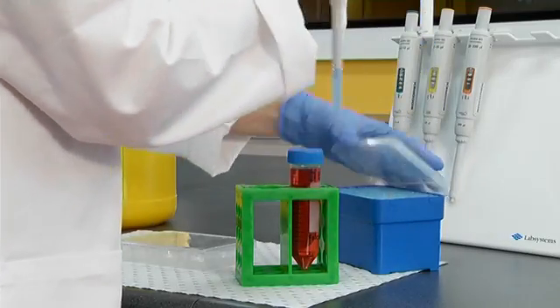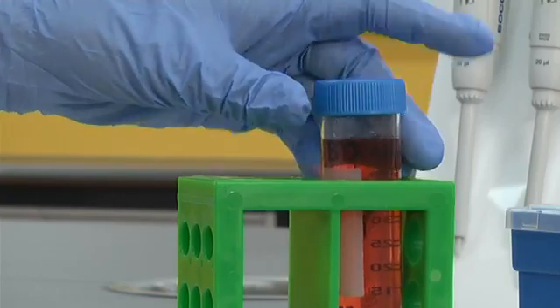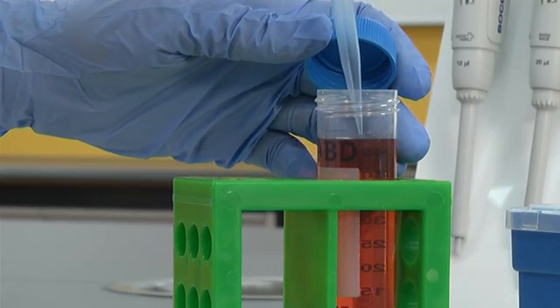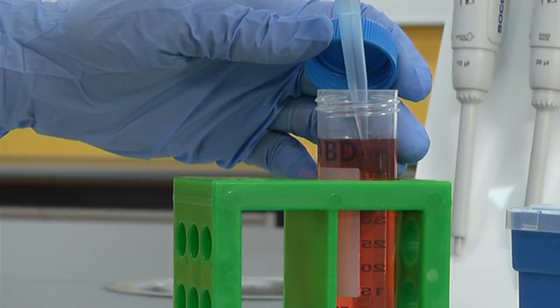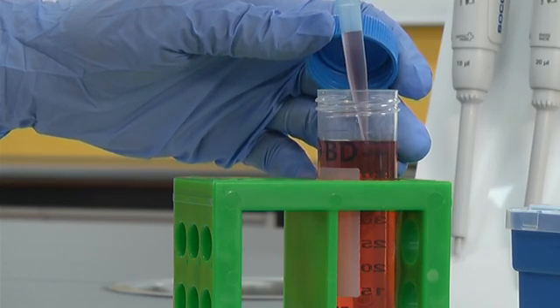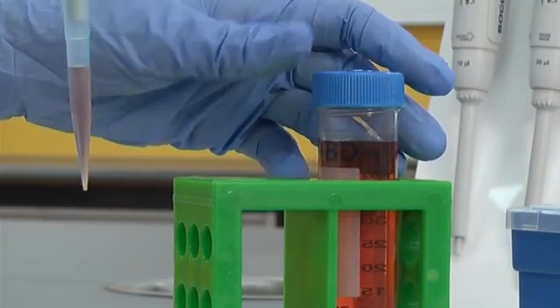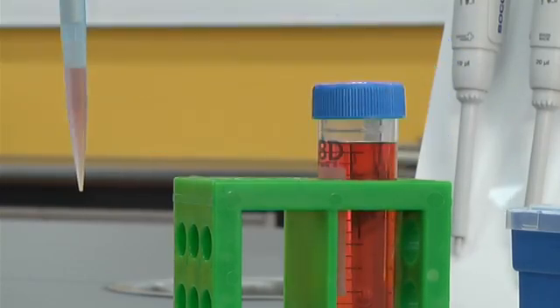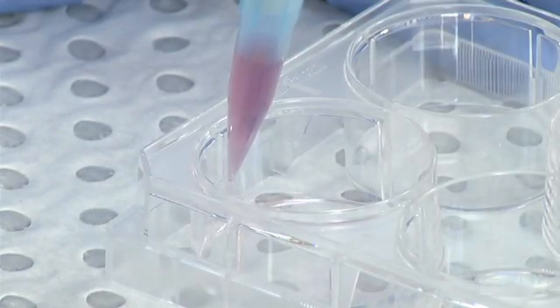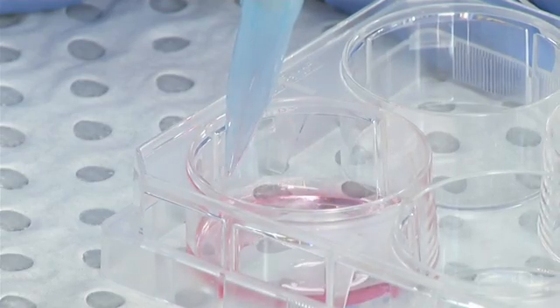Before placing the tip into the solution, depress the plunger down to the first stop. Place the tip into the solution — ideally the tip should be just below the surface of the solution. Slowly release the pressure on the plunger to draw the solution into the tip. Now the tip should hold a volume of liquid equal to the volume set on the pipette. Dispense the liquid by placing the tip into the receiving vessel and depressing the plunger down past the first stop and all the way down to the second stop to expel all the liquid from the tip.